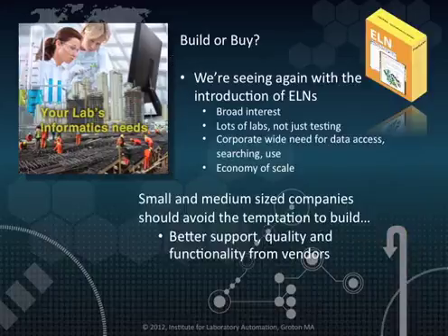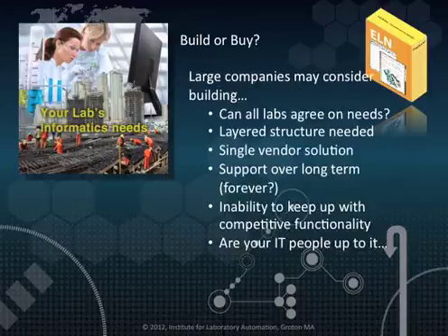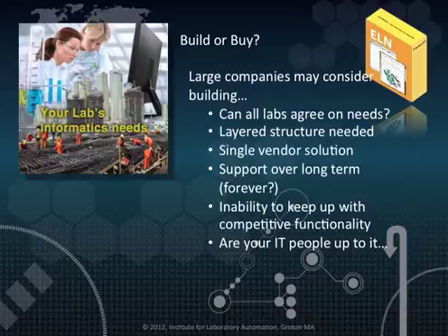Small and medium-sized companies should avoid the temptation to build their own electronic laboratory notebook system. They will probably get better support, a higher quality product, and broader functionality from vendor offerings. In large companies that have the resources to fund and manage such a project, there are other concerns that need to be addressed. Is there enough common agreement among laboratories on the functionality for an in-house built electronic laboratory notebook system? It may be possible to build a layered structure which has a common underlying database with a discipline-specific layer on top of it that can be customized to suit the needs of individual laboratories.